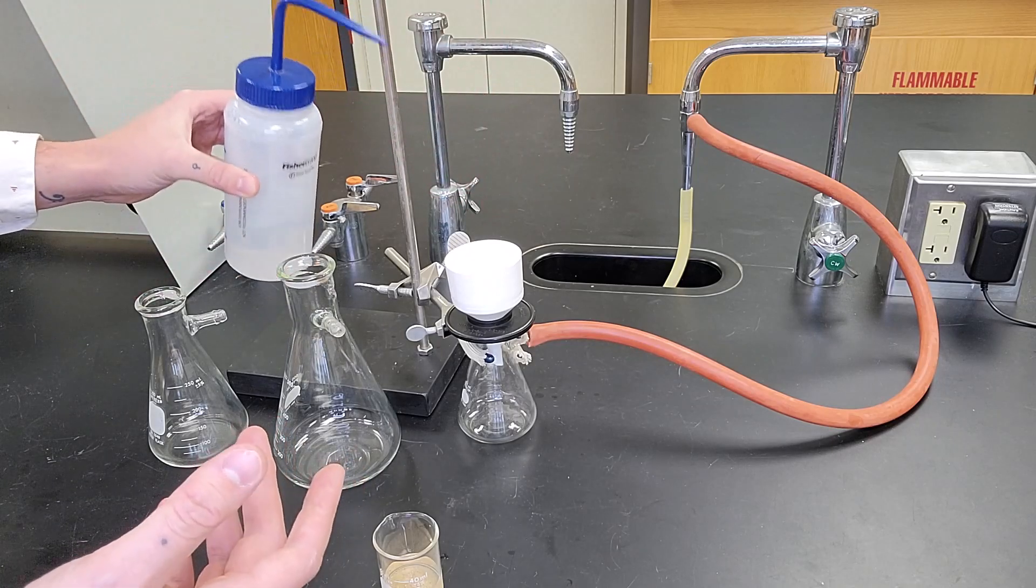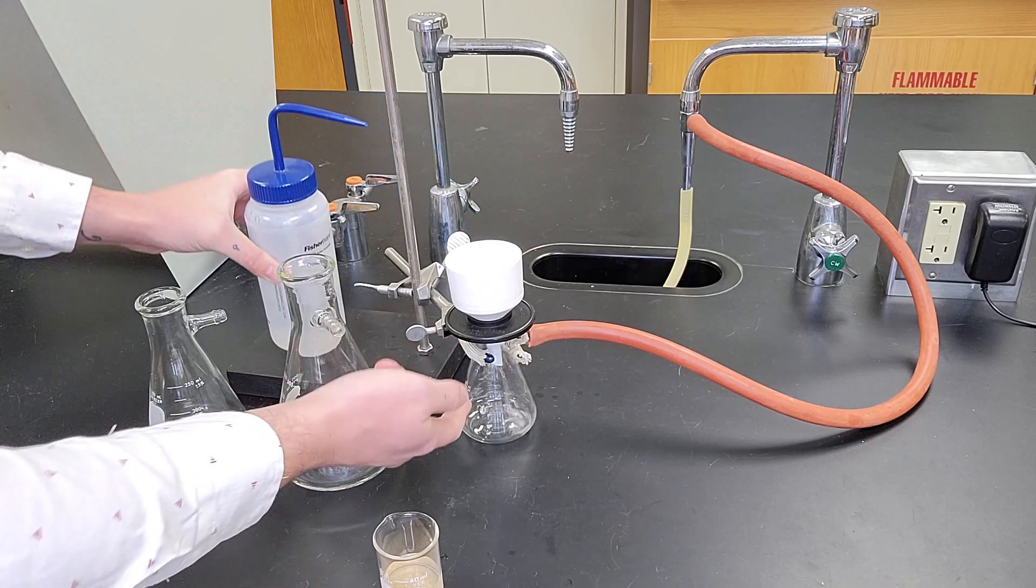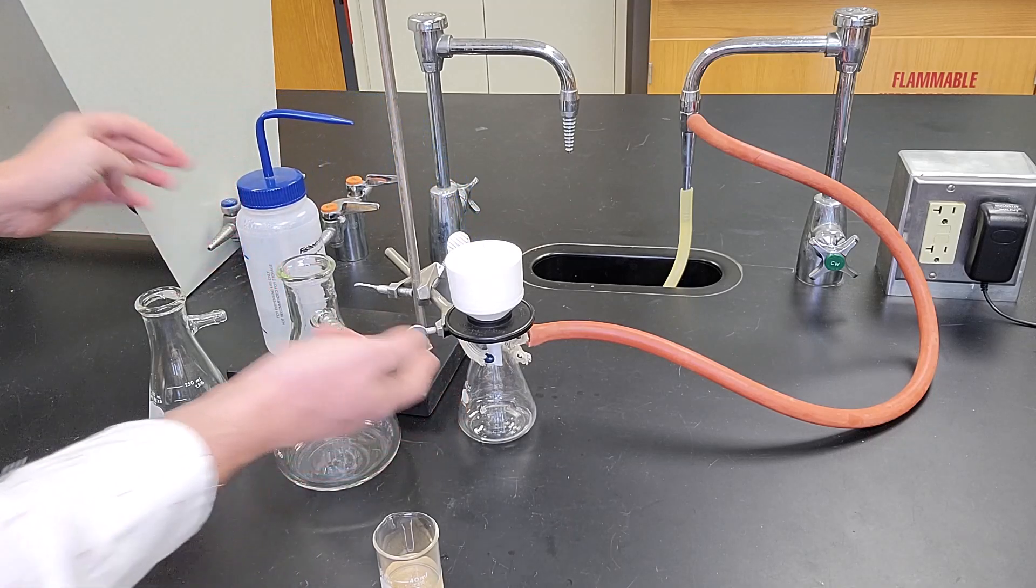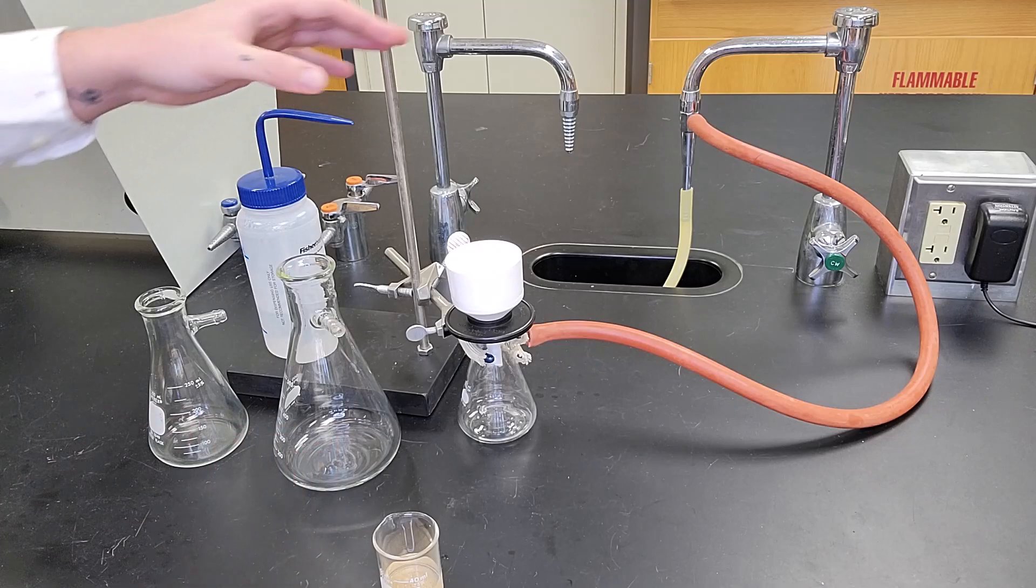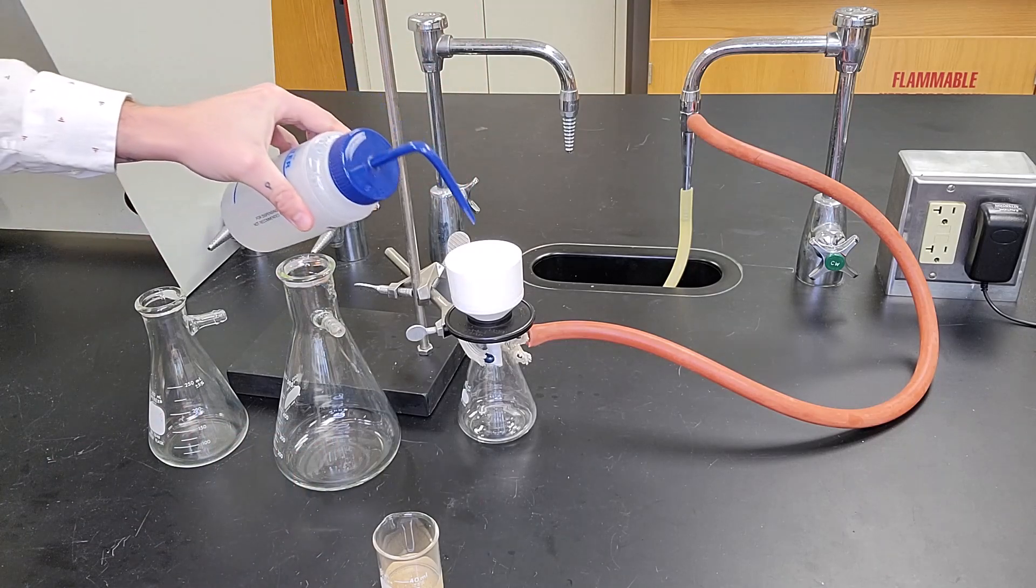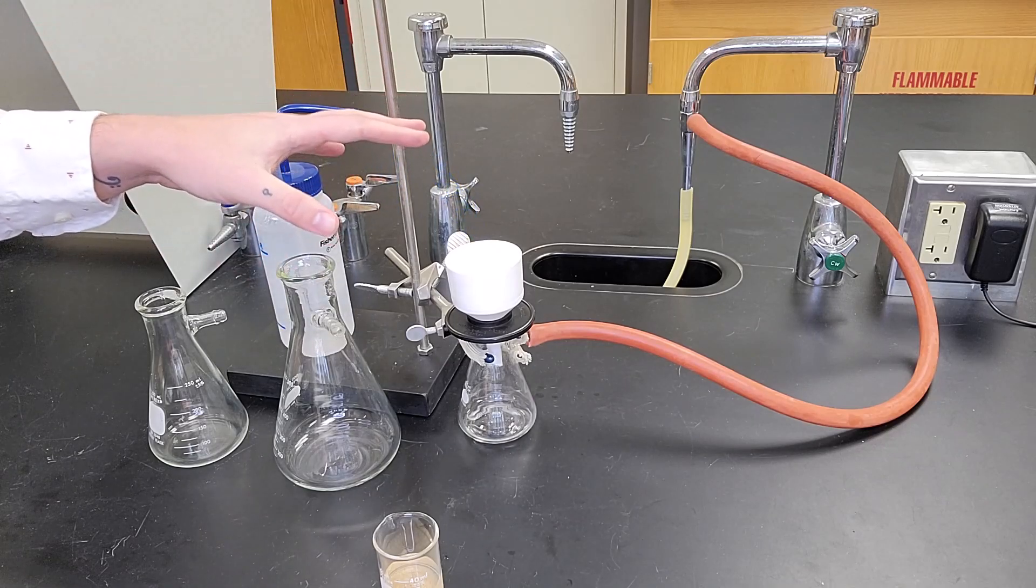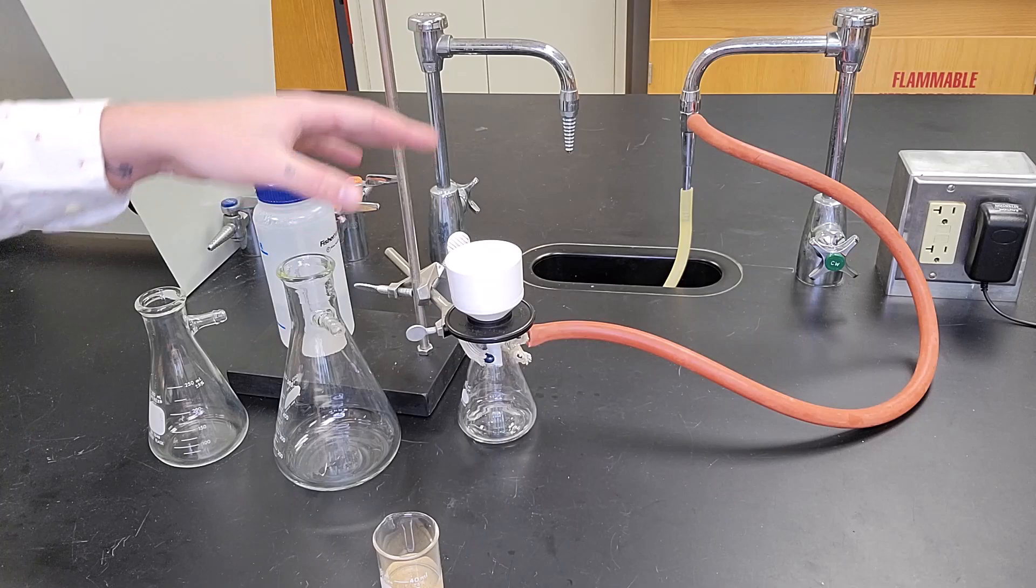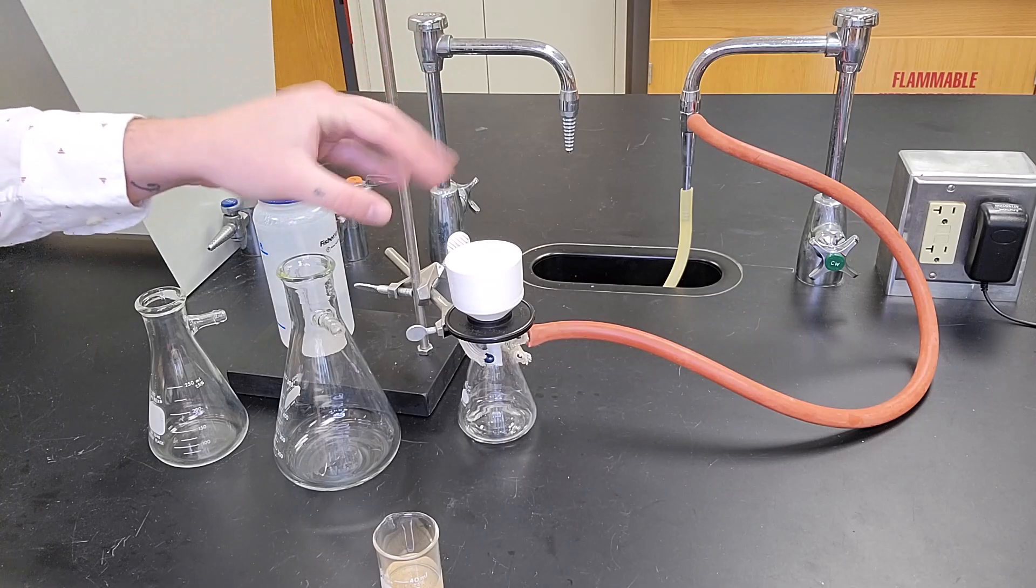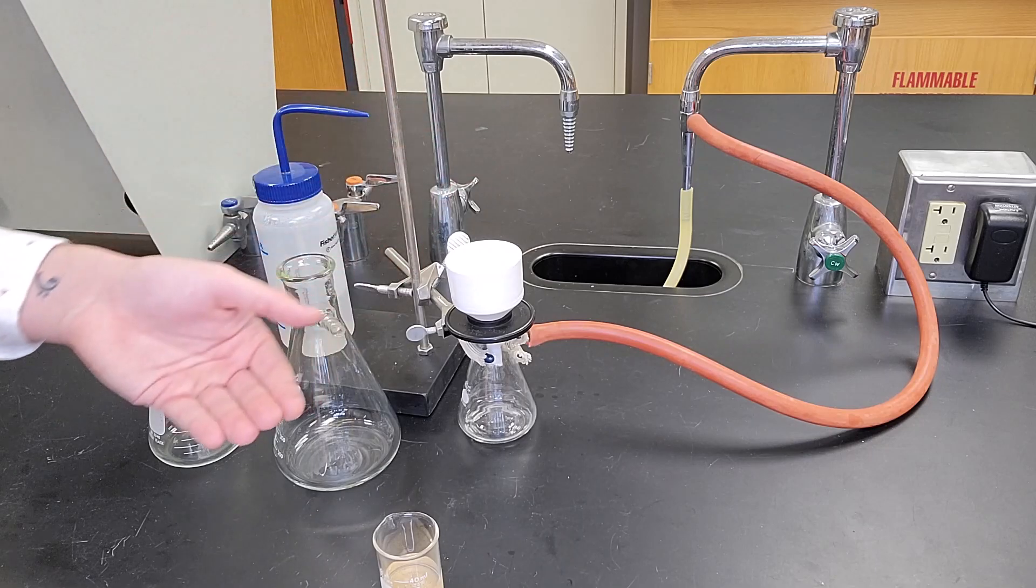So what I'm going to do is take my wash bottle and spray a little bit of water, and what we'll see is the water starts coming through the bottom. The filter paper is now adhered. I'm actually going to make sure it's a little wetter. It doesn't really matter how much solvent you put through on this one—you really just want to make sure you put enough to adhere it to the filter so when you pour your solid, you don't lose it through the bottom.